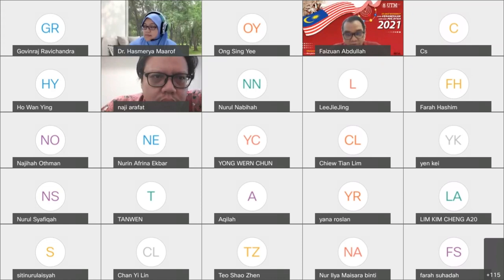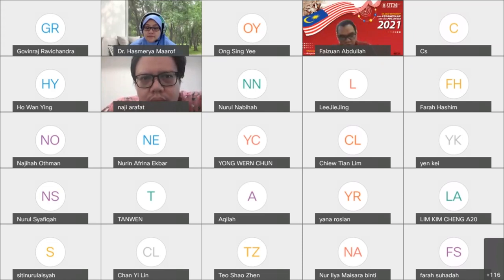For today, the first experiment, the analyte is nickel. So the DMGH, dimethylglyoxime, is an organic precipitant used to determine the nickel using the precipitation process.